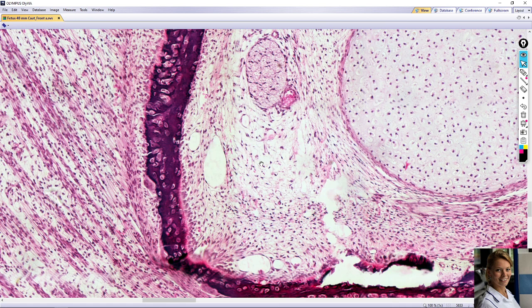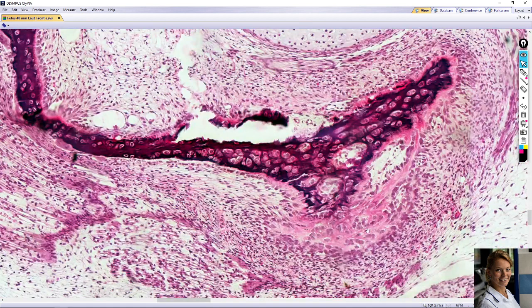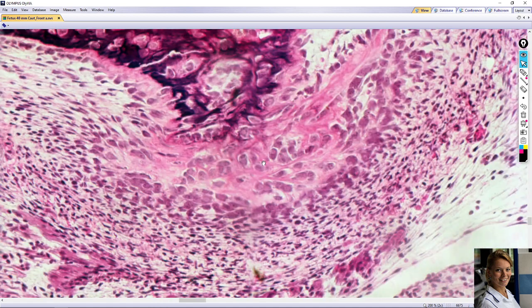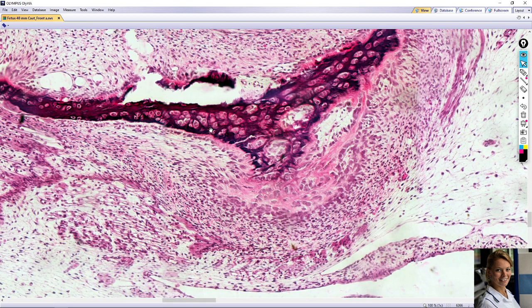Later on, mesenchyma condenses and becomes highly vascular. Here you can see small capillaries, and precursor cells differentiate into osteoblasts. For example, here you can see condensed mesenchyma and precursors which differentiate into osteoblasts, which begin to deposit unmineralized matrix rich in type 1 collagen called osteoid.